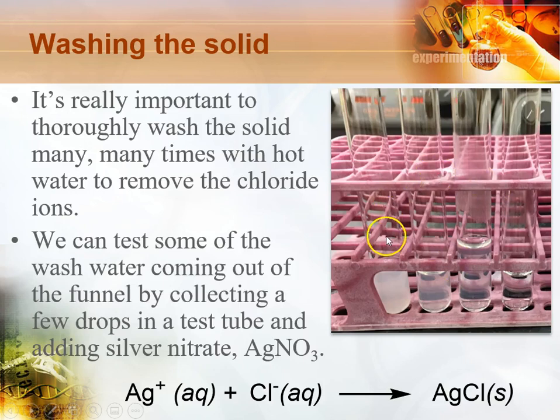You know when you're finished, what you should do is you should get a series of small test tubes, and you can collect some of the drops coming out of the filtrate, and you want to make sure that there's no chloride in it.